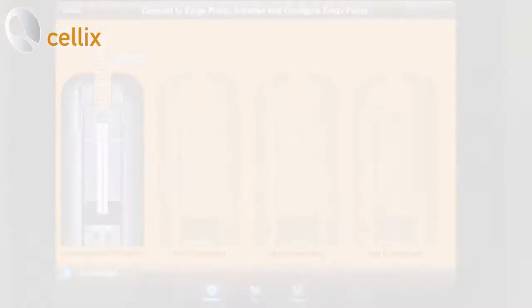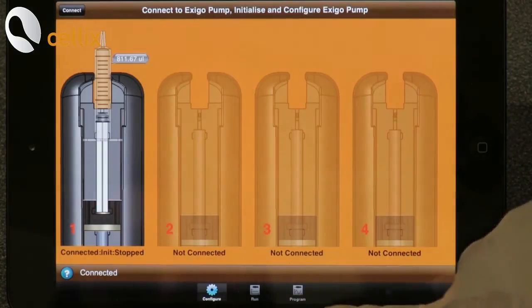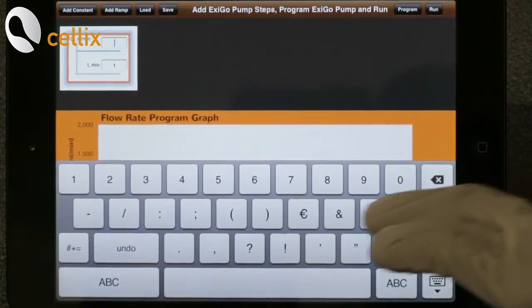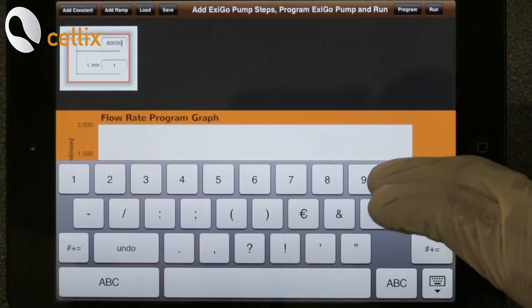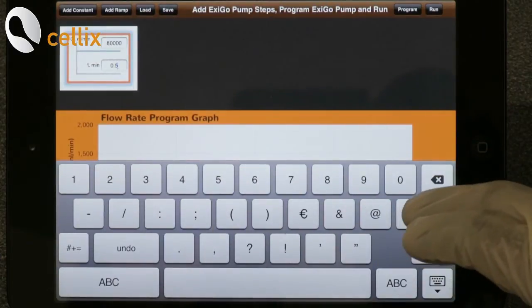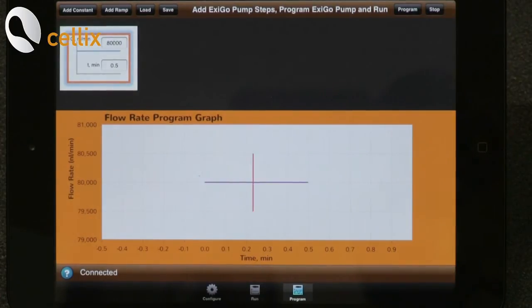Now your syringe is set. Next we are going to connect the tubing to the chip to wash the channels. For that we need to program the flow rate. In the application you click Program, click Add Constant, and in the small window you change to 80,000 nanoliter per minute, click Done. For time you click 0.5 minutes, Done. Then click Program and click Run.